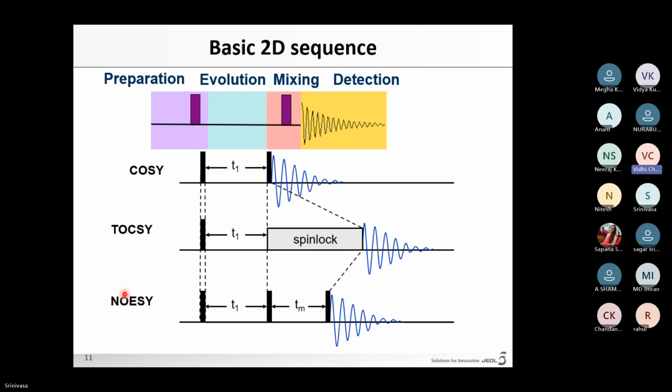I have a question. In a 2D experiment, in all experiments, will spin be off, or in some experiments will spin work? Ideally, you can turn the spin off for all 2D experiments. But in some of the basic experiments like COSY or HMQC, if you spin it on also, it won't make much difference, because these are magnitude mode experiments, very strong experiments. They can suppress those spinning sidebands and issues. So in 2D experiments, you should keep the spin off. Okay. Thank you.